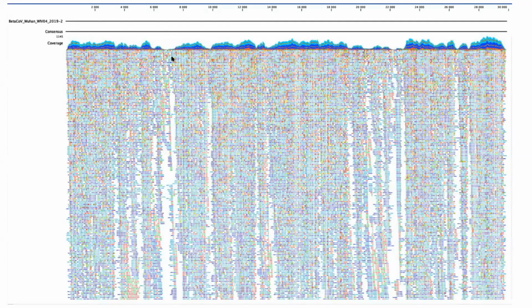What does it mean in terms of reliability of the sequence that we see in the consensus genome? That tells us that wherever we have high coverage, and that high coverage produces a consensus that is almost perfectly aligned between all the different sequences, that is a high confidence region. When we have a lot of variation, we either have less confidence in a specific portion of the genome, or potentially we'll talk about additional types of analyses that can extract other useful information from those different regions.